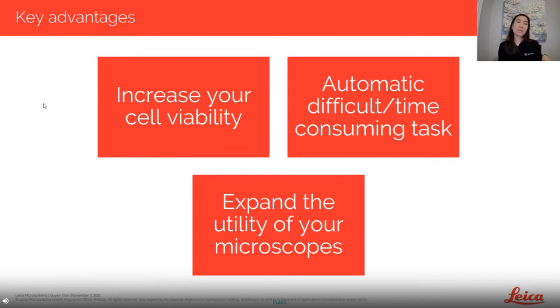Now we can apply a deep learning model to really do this automatically. It allows you to enormously increase your output because you no longer need to sit there and do this manually. You can apply the model overnight, over the weekend, and come back to results really quickly.